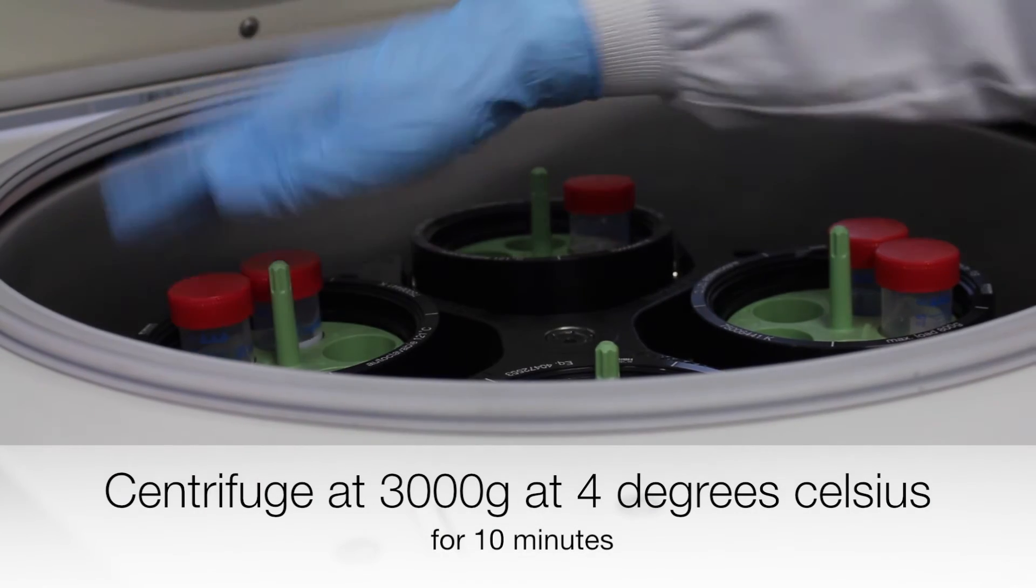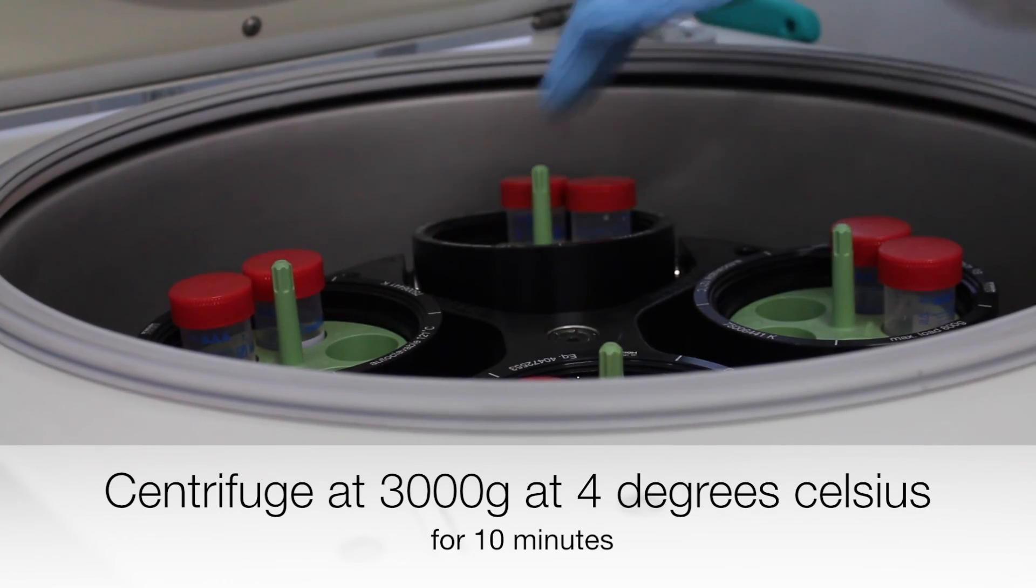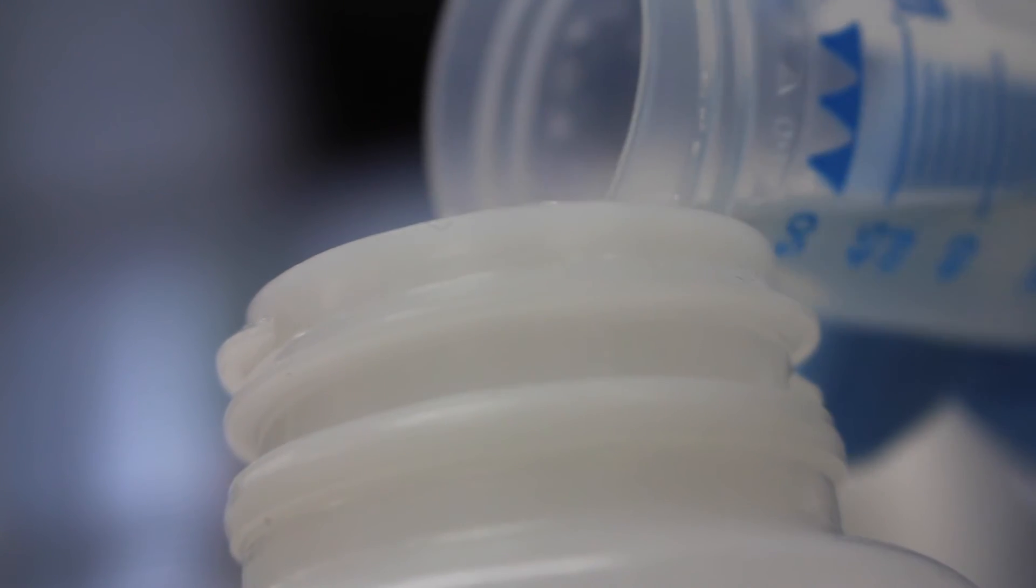As before, the tubes are centrifuged at 3000 g at 4 degrees Celsius for 10 minutes. The supernatant is disposed of carefully.